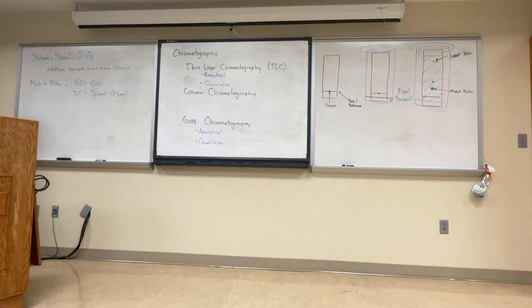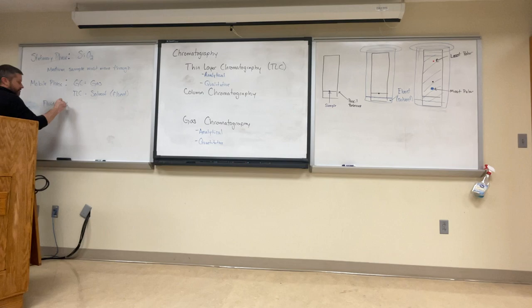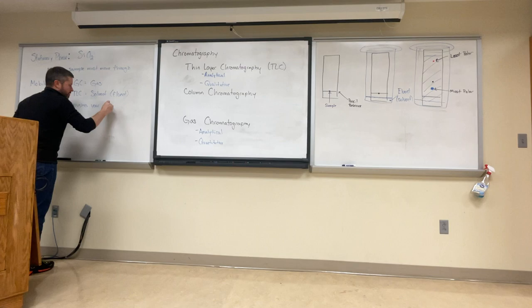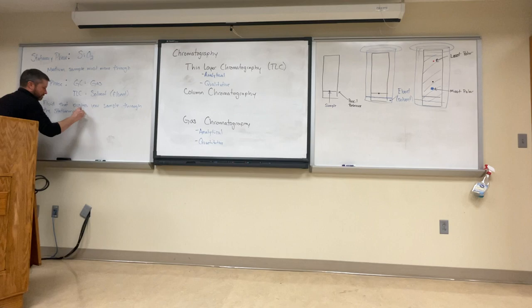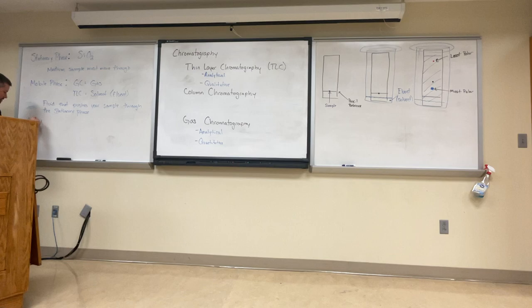Right, and then the third thing that you have is the analyte. So the mobile phase is the fluid that pushes the sample through the stationary phase. And then the third thing that we have is the analyte. And that's just whatever sample we're trying to analyze.